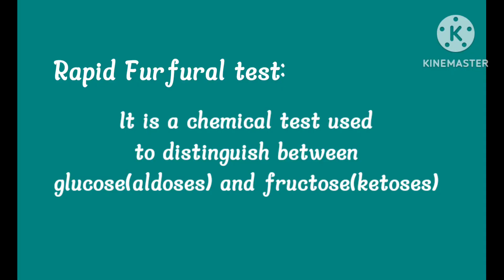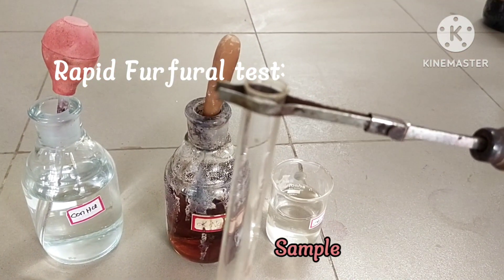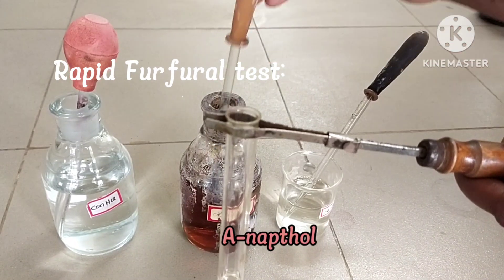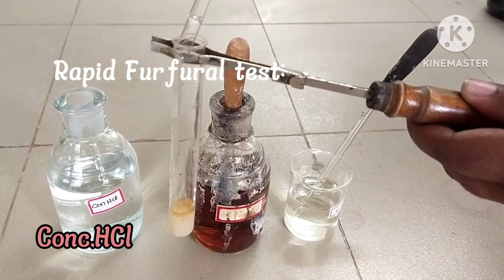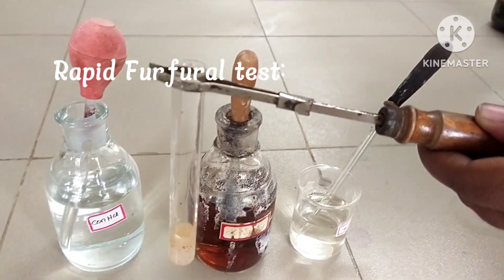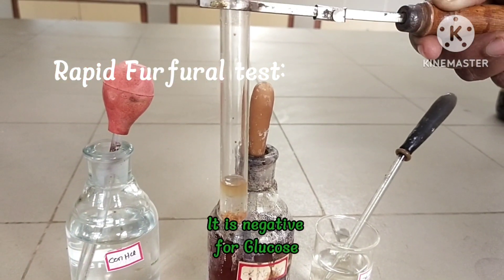Rapid furfural test: This test is used to distinguish between glucose and fructose. The sample is added to ethanolic 1-naphthol and concentrated HCl. The solution is then boiled, and if a purple color appears, fructose is present. This test is negative for glucose. Procedure: To the test tube, add 1–2 ml of sample solution, then add 1 ml of alpha-naphthol solution and 5 ml of concentrated hydrochloric acid. Boil the solution. No color appears — this test is negative for glucose.